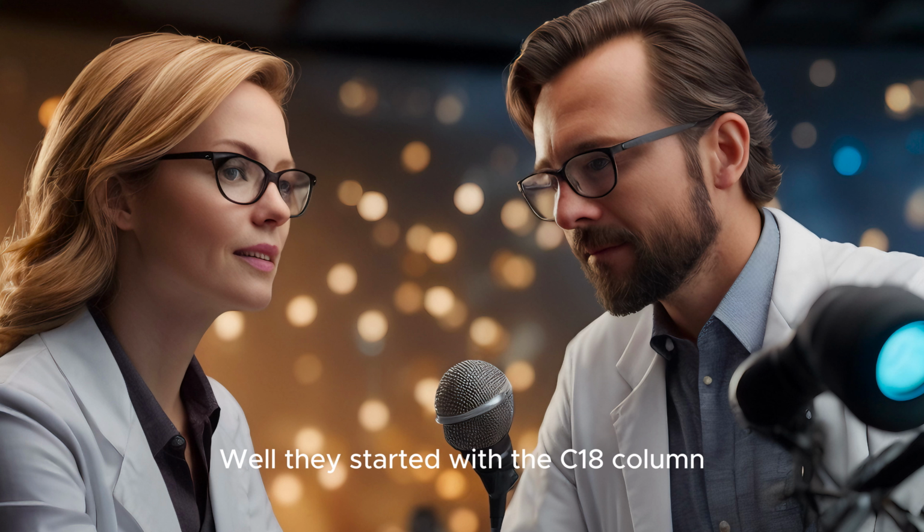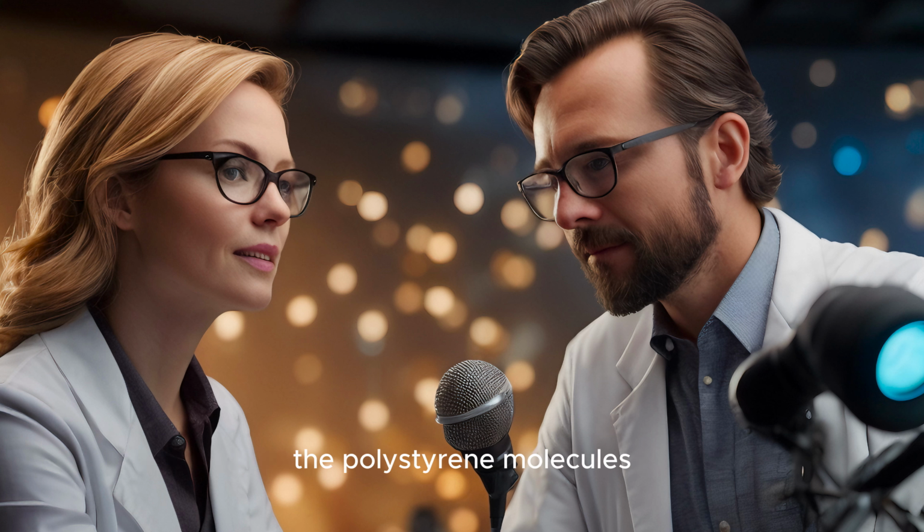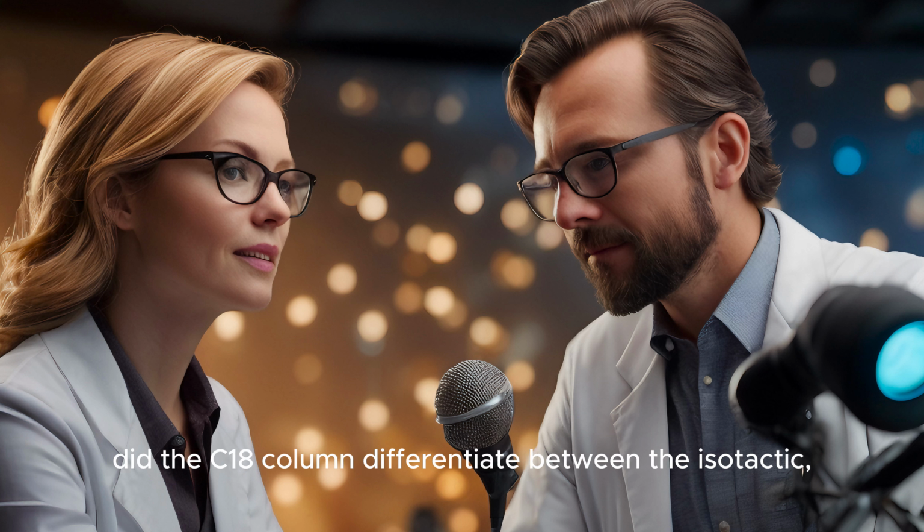Well, they started with the C18 column, which is kind of the gold standard in this type of chromatography. And it did a decent job of separating the polystyrene molecules based on their size or molecular weight. So smaller chains zip through faster, while the bigger ones took their time. Makes sense. But what about separating the isomers? Did the C18 column differentiate between the isotactic, syndiotactic, and atactic forms?